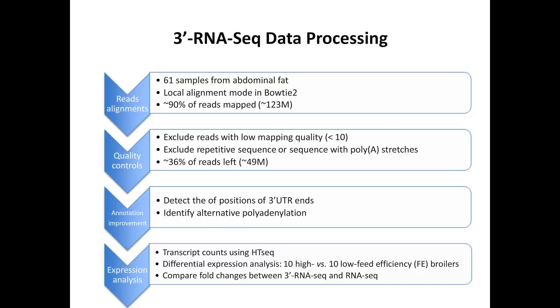This has been studied before, in a published paper that compared high feed efficiency with low feed efficiency chickens. So we used the same data set to do the same thing with 3' RNA sequencing and to find out how high the correlation is between these two technologies.